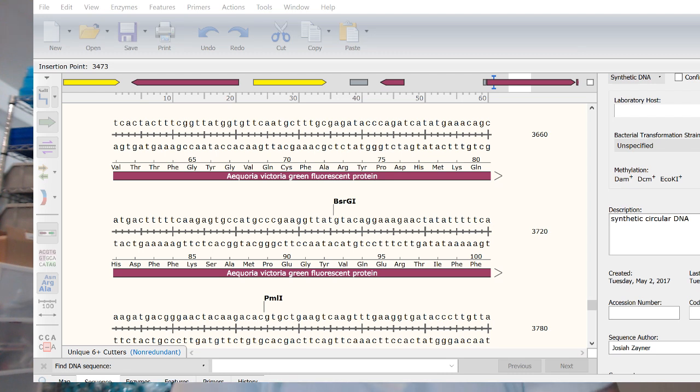Go there. NCBI BLAST. The program's called BLAST. What you can do is take a plasmid and compare it to everything else that's out there. So you can try to find out, are there some plasmids that exist without these pieces of DNA? Are there some plasmids that have this piece of DNA? How does it compare? How does it contrast?